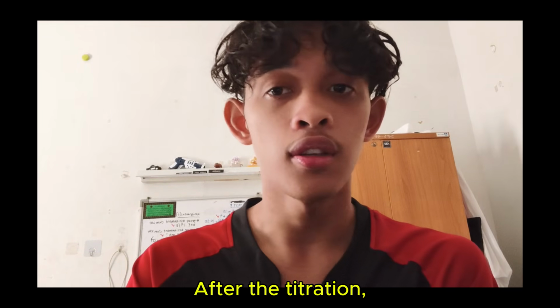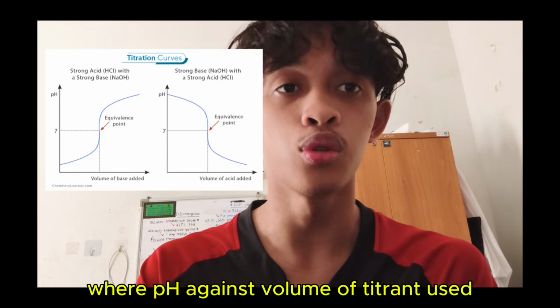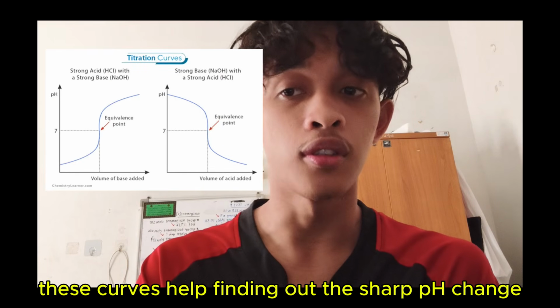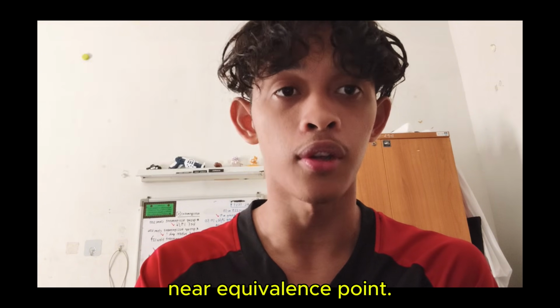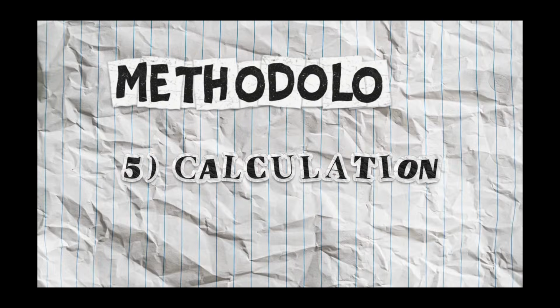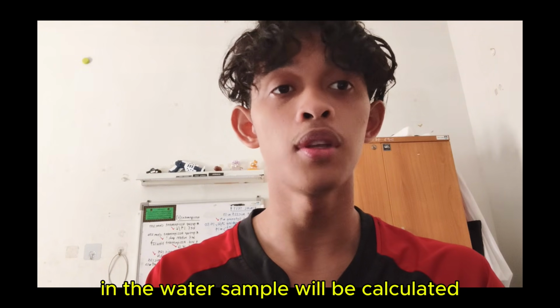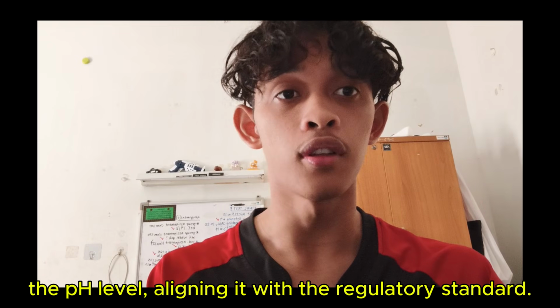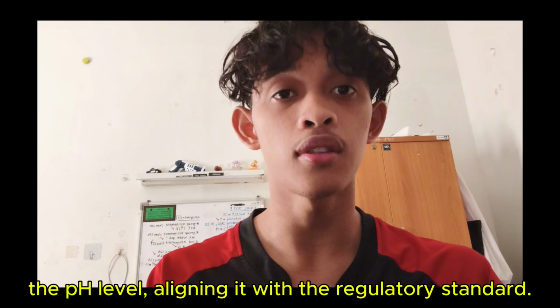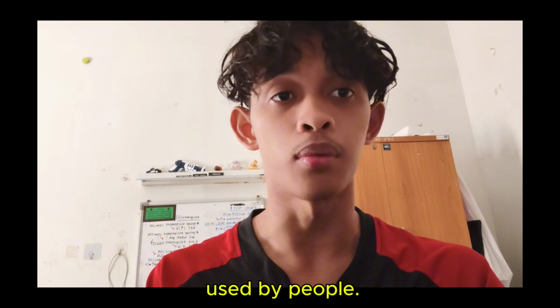After that, the titration curve graph, where pH versus volume of titrant used, will be plotted. This curve helps in finding out the sharp pH change near the equivalence point. Lastly, the concentration of acid or base in the water sample will be calculated. This calculation is needed to adjust the pH level, aligning it with the regulatory standard, ensuring the water is safe to consume and use by people.